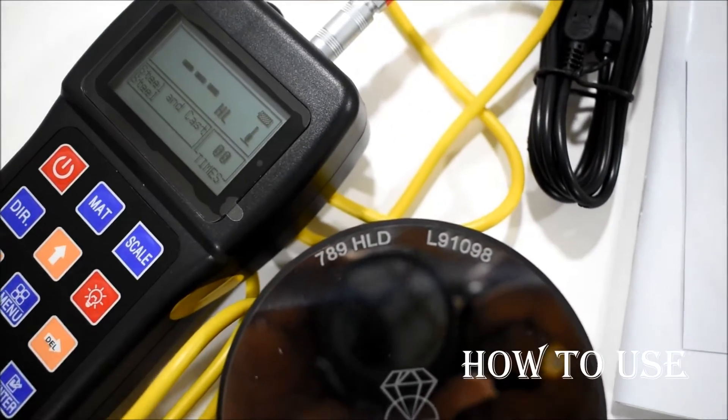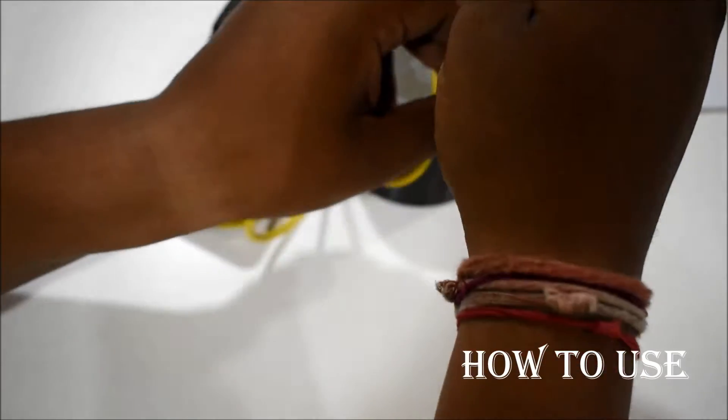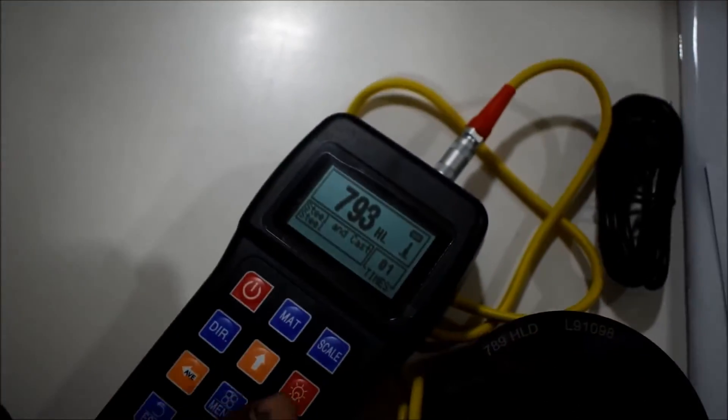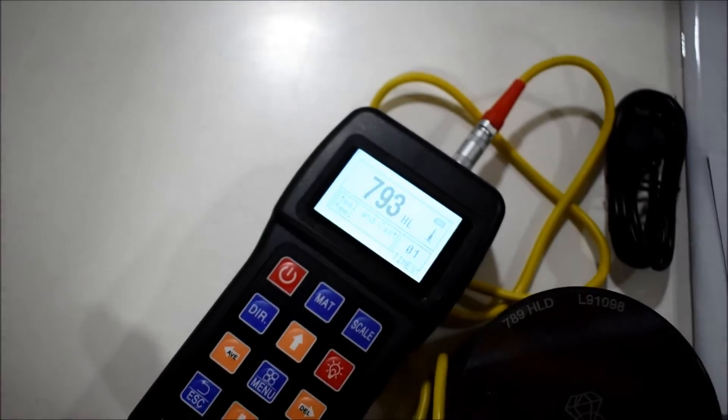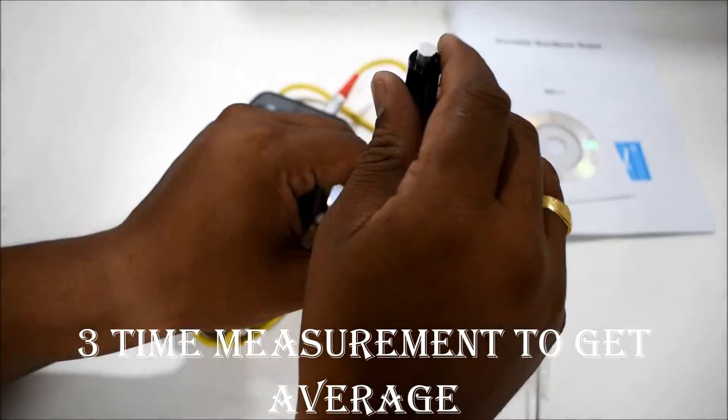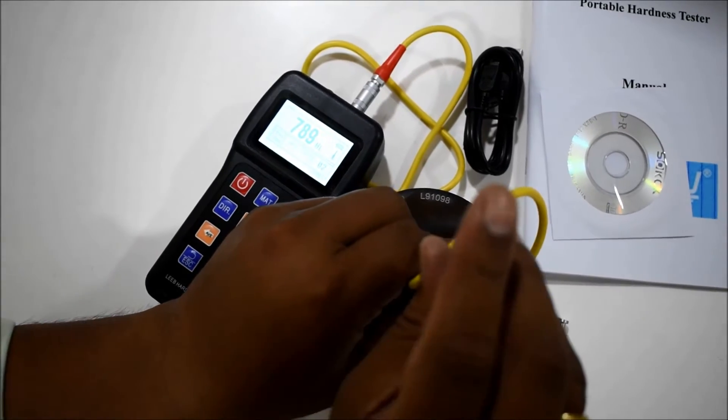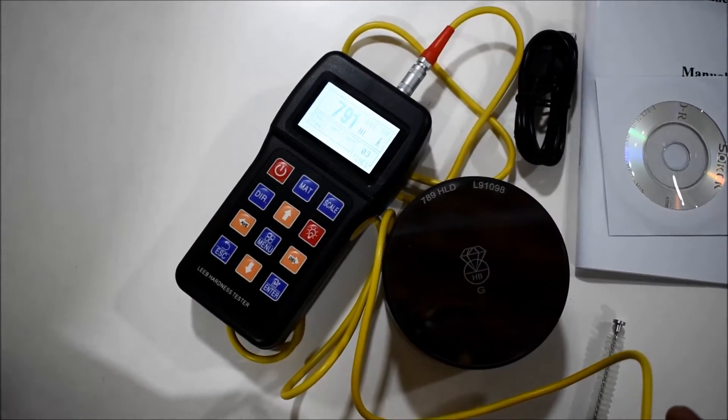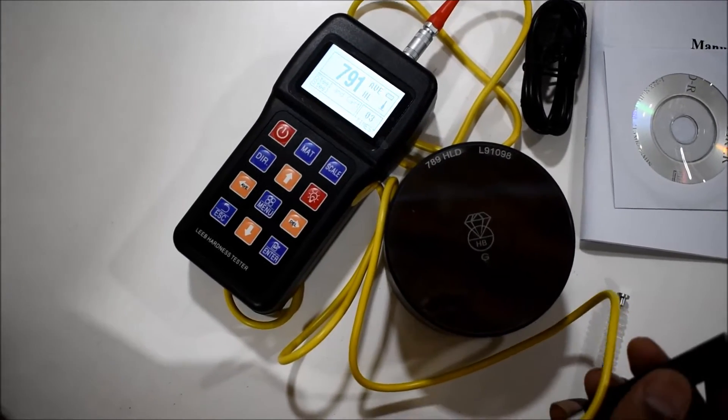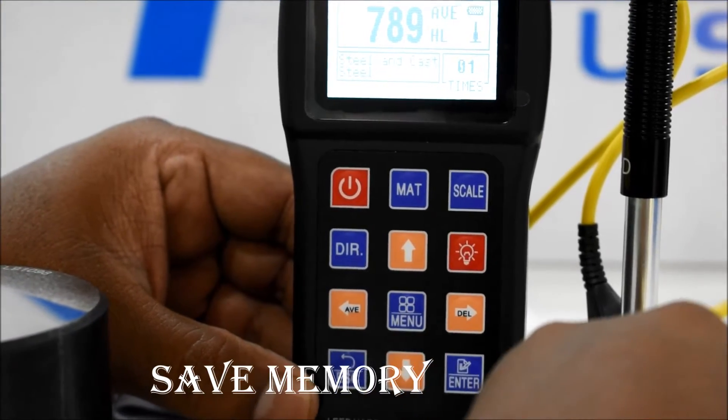We get 789 HLD on the block. Take 3 measurements, then get the average of 791. Use the save option, then we will go to check the saved memory.